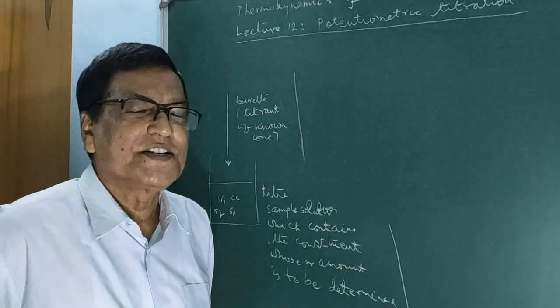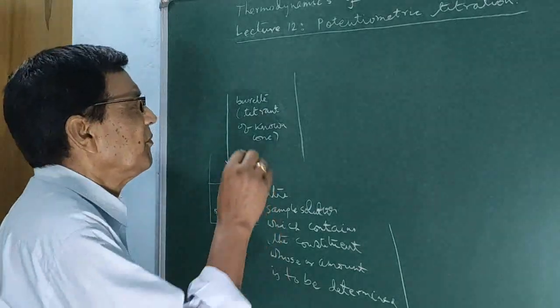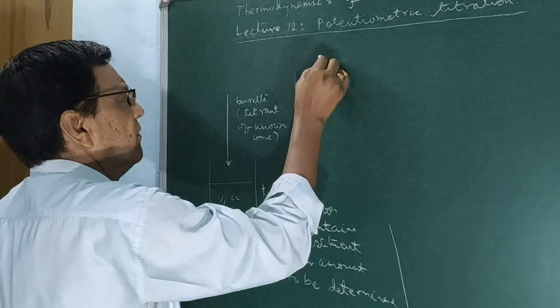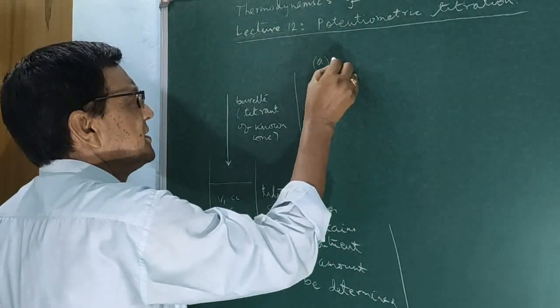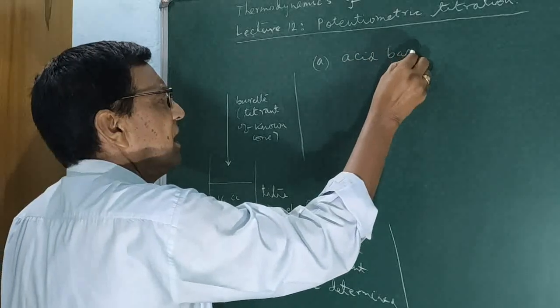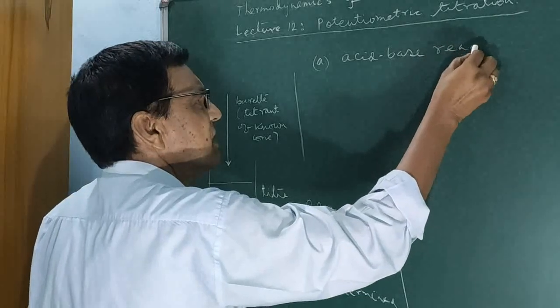Let us first discuss the potentiometric titrations on the basis of the acid base reaction.